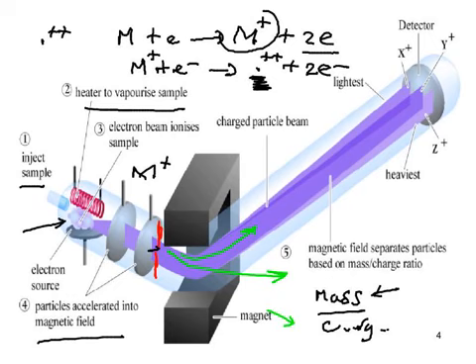It's like having someone very heavy bumping into you compared to someone very light bumping into you at the same speed. Clearly the heavier person has more momentum, and that's what's happening here with mass. The heavier particle coming in with more momentum ends up being deflected less than a particle traveling at the same speed but lighter. What about charge? How does it influence the whole thing?